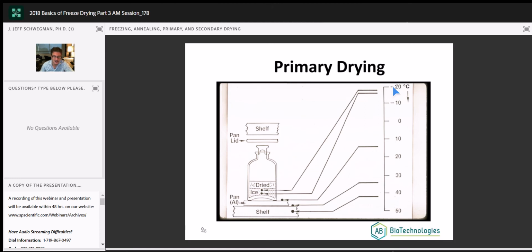Now this is pretty extreme because, again, we're assuming we have a lid on the pan. We're assuming we leave the vials on the pan. We've got a molded vial. We don't do this anymore. It used to be this extreme, but again, this just tells us why we put vials directly on the shelf. We don't use these molded vials because we can greatly reduce this. Okay, but still, we're going to see a fairly big temperature differential between thermal fluid in the shelf and the product temperature when we probe with our thermocouples. It may be, I've seen it as high as 25, 30 degrees C.